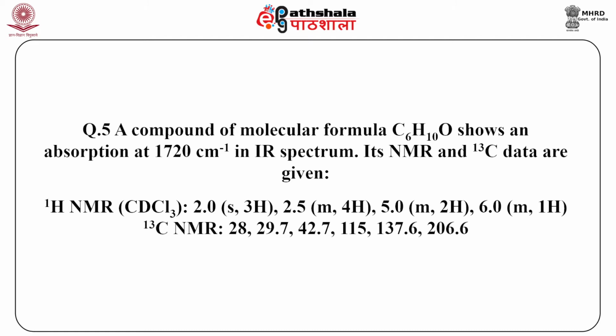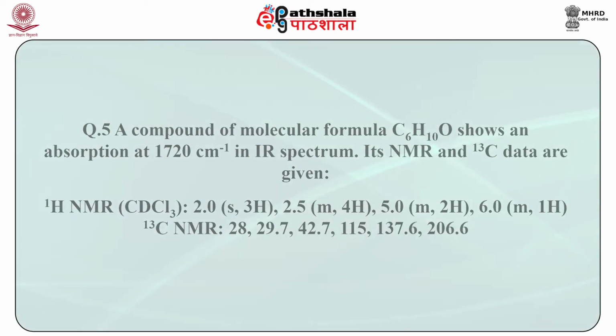Carbon 13 NMR shows 28, 29.7, 42.7, 115, 137.6 and 206.6 ppm values.